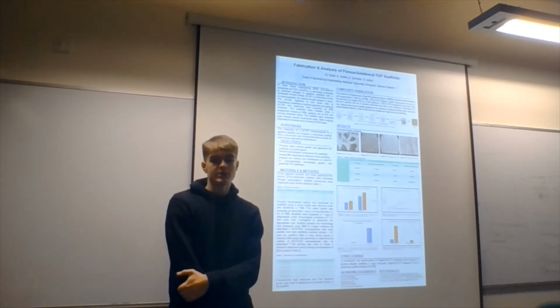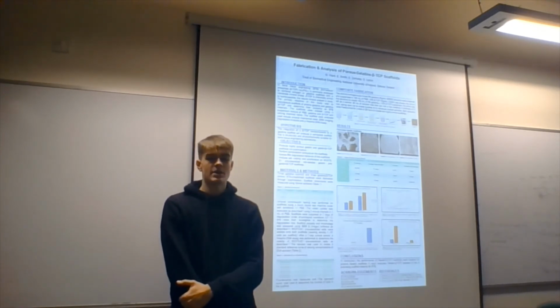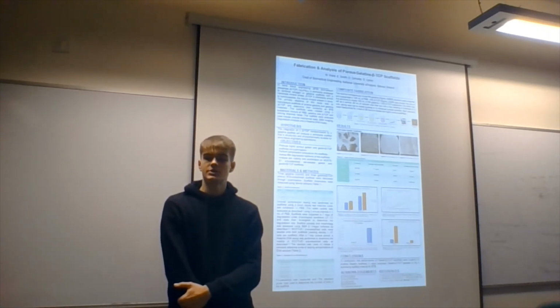Following ImageJ analysis, it was found that the scaffolds with beta-TCP had a much higher porosity than the control scaffolds, which is shown in figures 2 to 5. Beta-TCP scaffolds had an average porosity of approximately 50%, whereas the porosity of standalone gelatin scaffolds was lower than 5% for each case. Figure 6 presents the swelling and degradation rate of both scaffolds. Gelatin scaffolds with infused beta-TCP show a high result in both cases compared to a pristine scaffold. These results can be controlled with ratios of chemicals during fabrication to simulate the physiological conditions.